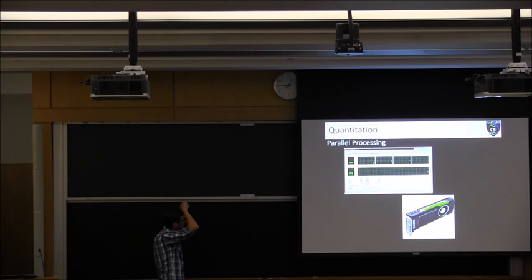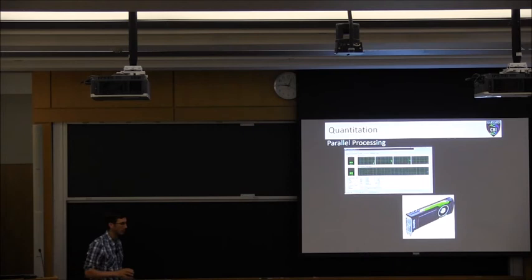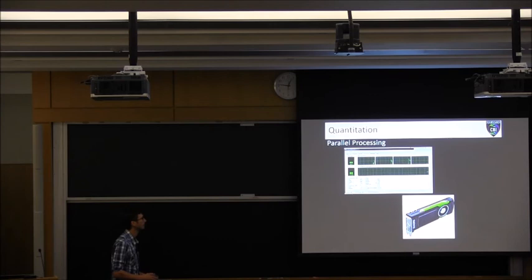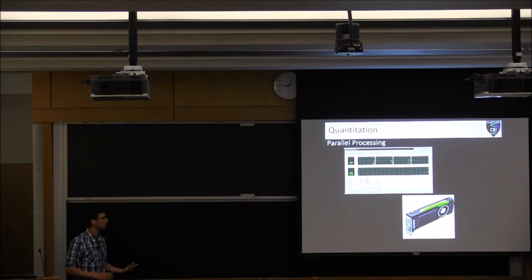Just a couple points on quantitation. Quantitation is totally separate from visualization. We're at a point now where visualizing the data isn't much of a problem. It takes a little while to get to that point where you have everything reassembled and rendered into a three-dimensional image, but there's no hiccups along the way. Quantitation is still something that I'd say is really challenging, and there isn't a super easy solution for it, but we are seeing sort of lights at the end of the tunnel, or better ways to get there.